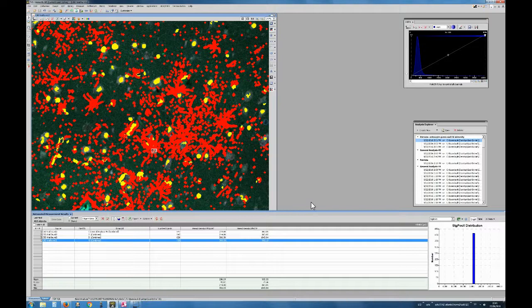There are a lot of different filters that you can use, and a lot of different things that you can do. It's very important that you start analyzing your data while you're doing your imaging. Do not acquire lots of images first and then try to analyze, because the analysis will depend a lot on the way you have imaged. So it's extremely important that you define your scientific question very well, and that you evolve the analysis together with the imaging. You will have to go back to the microscope to re-image because you realize that the analysis is not good enough, etc.